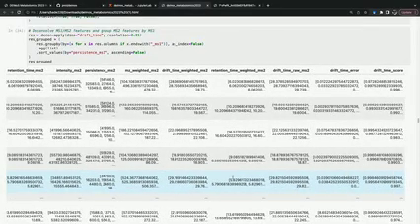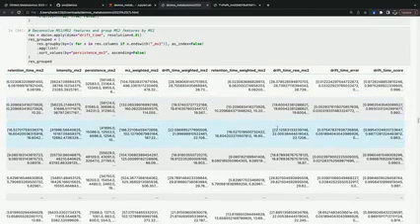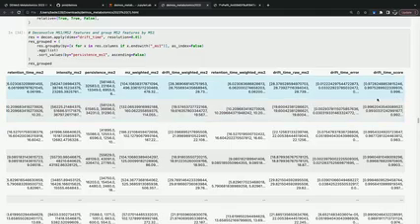Here we've grouped together all of those MS2 features by the precursor ion. And then each of those has an associated score in drift time with it, which corresponds to how well it's associated with the precursor. And so if your fragment has a very high drift time score, then it's associated to that precursor with a very high confidence.